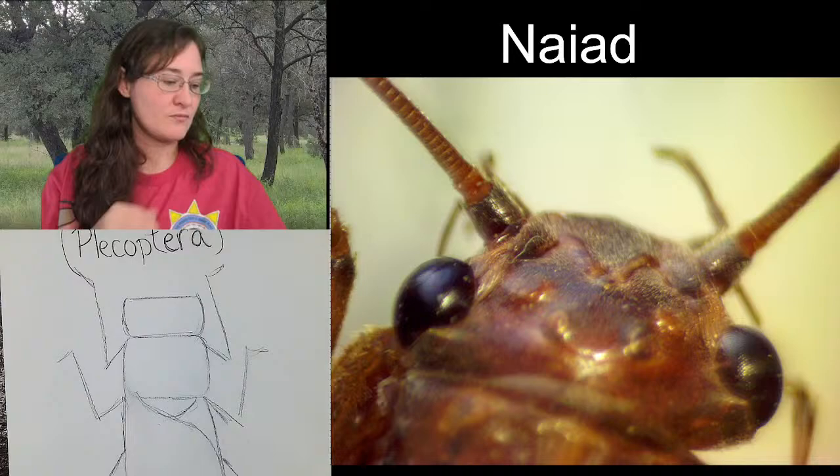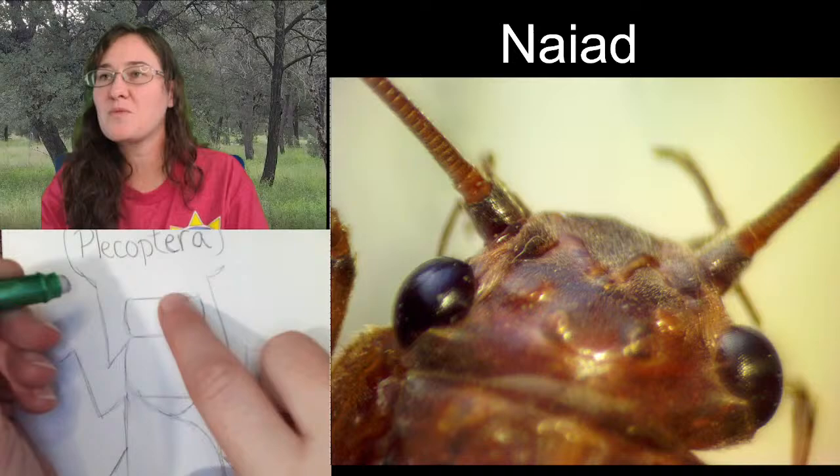Looking at the head, we are going to be changing a lot of these features.